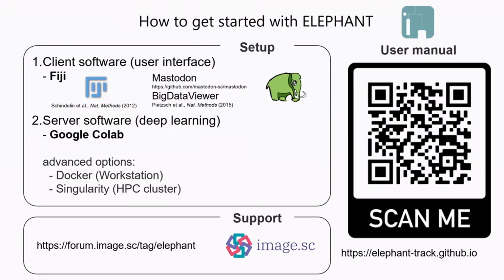So how do you get started with Elephant? Elephant implements a client-server architecture. Basically, the client is based on Mastodon on Fiji, so you can just click the update site to install it.